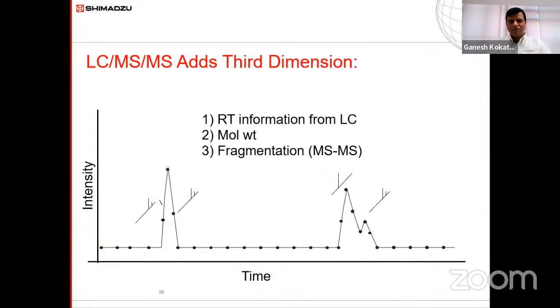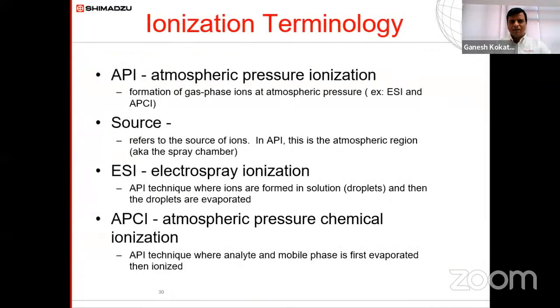So we are also discussing the MSMS part. Before going ahead, we need to understand, yesterday I think one of the sirs asked me what actually the interface is, how the HPLC sample goes into the MS, and what the different techniques used for that are.